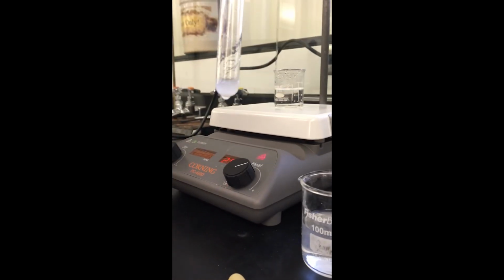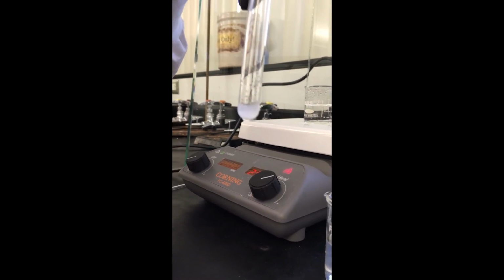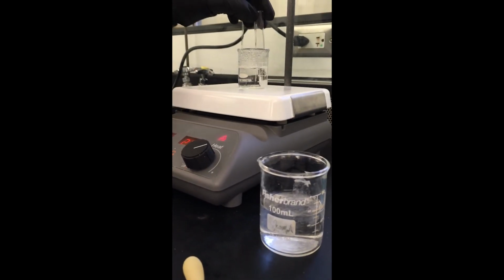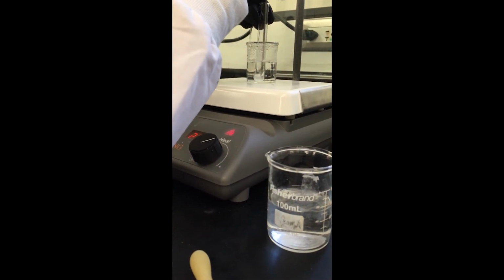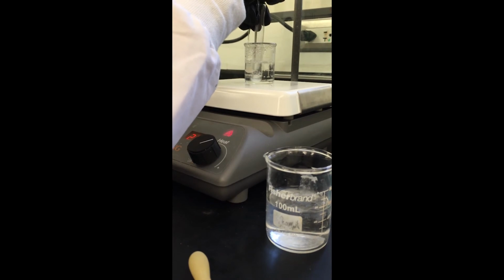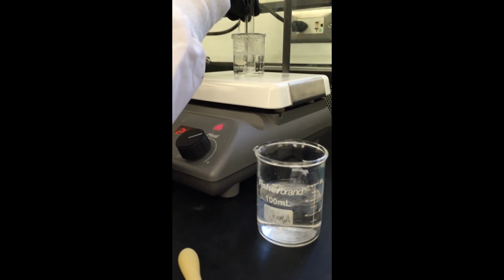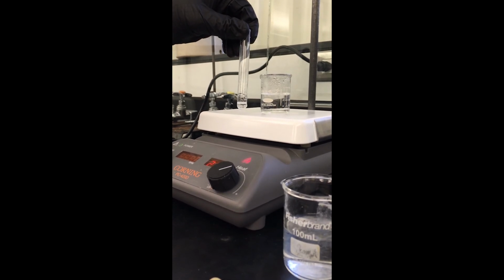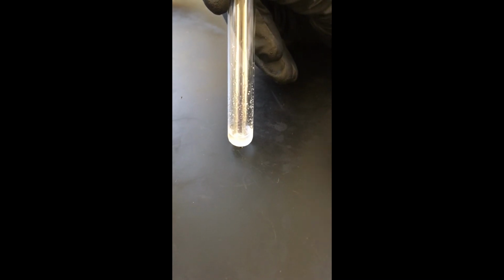And as you can see, it's gotten cloudy, meaning that we're forming crystals again after cooling it off. So I'm going to heat it back up, and then I'm going to let it cool at room temperature until it forms crystals. So go ahead and heat this up. Okay, no longer cloudy. And then I'll just go ahead and set this to the side until it forms crystals. Alright, so now that we've let this sit at room temperature for a bit, as you can see, we've got crystals in here.